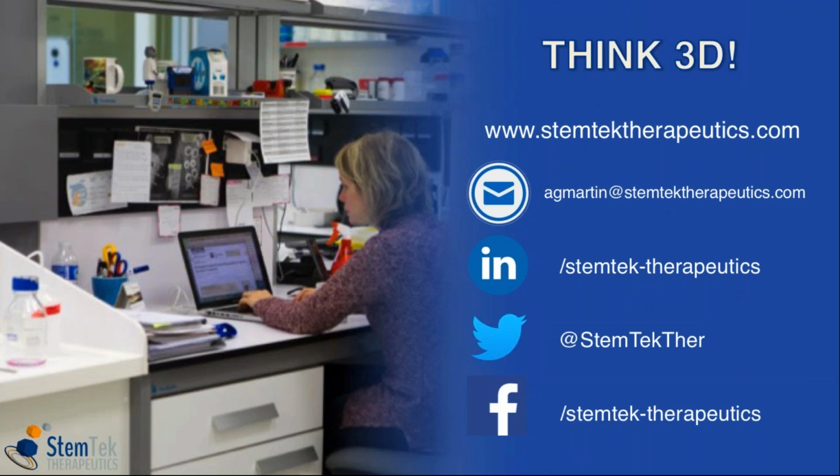Yes, we are working with some glioblastoma samples in the PDX system, and actually glioblastoma is one of the easiest models for spheroid formation. It was one of the first described, basically because it comes from the neurospheres models, and we have glioblastoma cell lines available for ordering right now. Glioblastoma is usually a very nice model for 3D spheroids. Other tumor indications are more complicated, more cumbersome, but glioblastoma is one of the easiest.